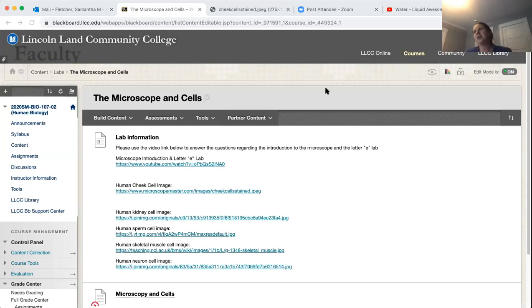What else can we see under the compound light microscope? What about atoms? Can we see those under the microscope? Molecules. Yeah, what about atoms and molecules? Can we see those? I'm not really sure. No, we can't. They're going to be way too small. The microscope is not that powerful. The atomic level is actually too small to be seen by any mechanism.